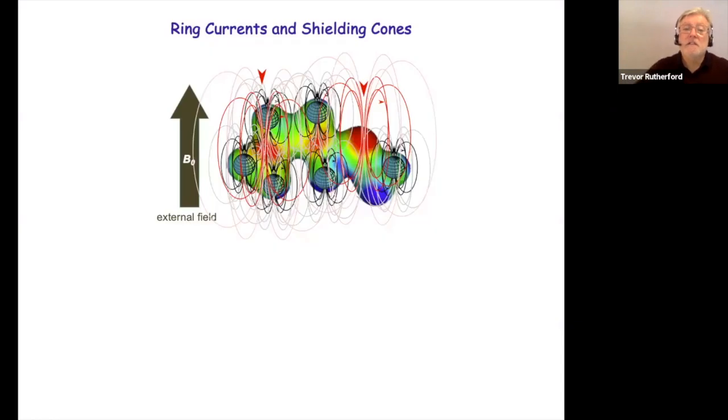So this is one of the things I said in the first slide, a landscape of local magnetic fields that is unique to every molecule that we put in the spectrometer. And so it's this landscape of magnetic fields that is so useful in giving us information about the functional group chemistry, the composition, but also the three-dimensional structure of what's going on.